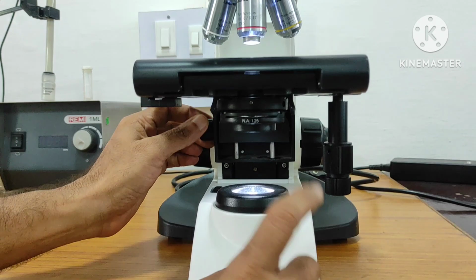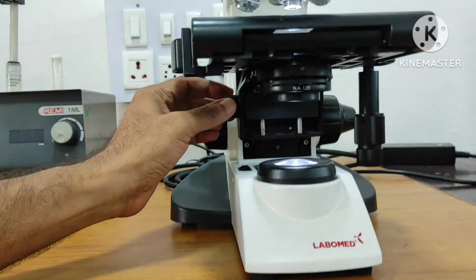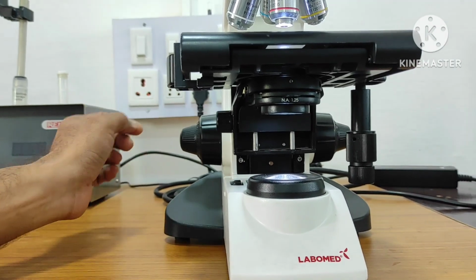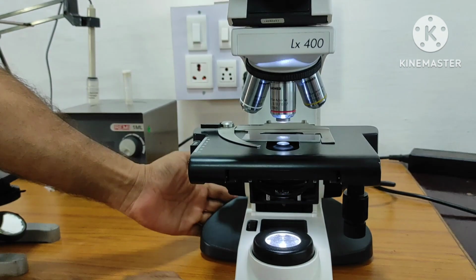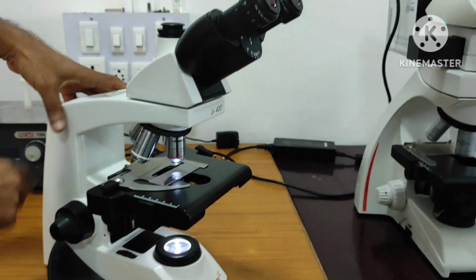Even for the condenser and the position of light, one knob is available, and we can fix that, right? How much light is needed, accordingly we can fix that also, right? Then this is the base of the microscope, and this is the arm of the microscope.